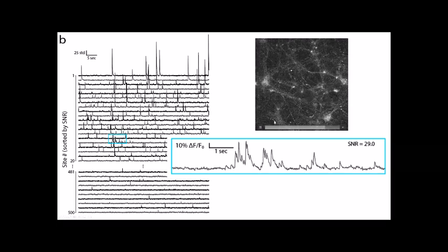And so if we watch movies like this for long periods of time, there's basically two classes of things. There are things that are, first of all, in focus. So this is wide field imaging, and there's a big problem with measuring the spatial extent of anything in wide field imaging because lots of things are out of focus. But there are very local little flashy events. I'm pointing at one little spot, but there's really hundreds of these spots.